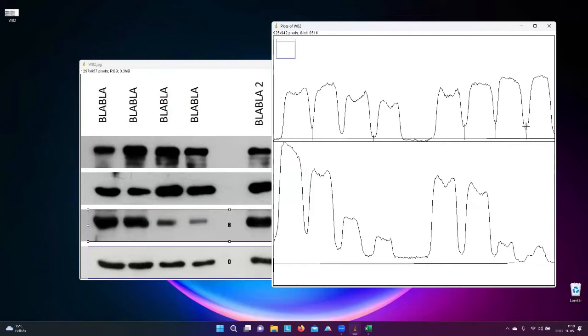These lines are theoretically closing the marks of the dense black parts. So these peaks and these ones, for example, are showing you that you had some black dot on the figure. So that's why this place here, which was not dark enough, you can close it with a single line.